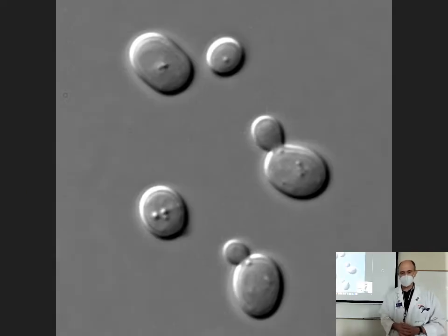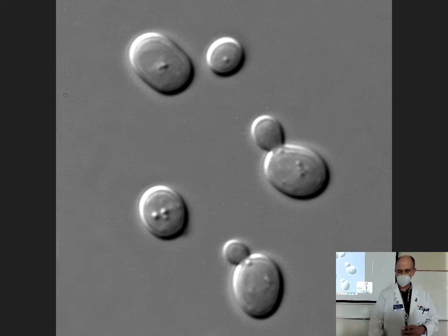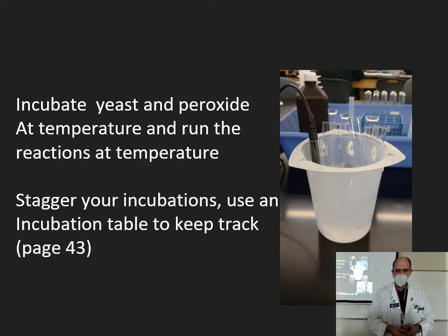So there's the organism we're looking at. That's yeast. They're single-celled eukaryotic fungi that reproduce a lot of times by budding. They split in half by mitosis and reproduce that way. They're found all over the environment as well, but we're looking at bread yeast. So now let me try to talk you into how to do this without messing it up.